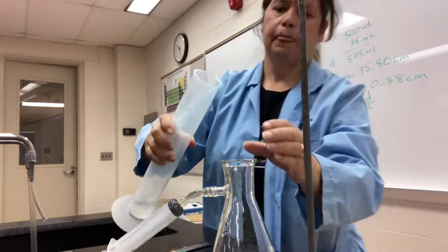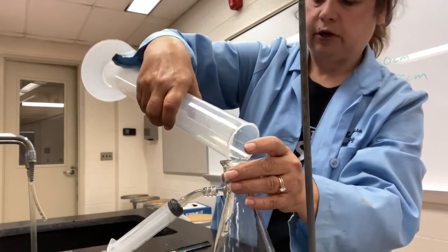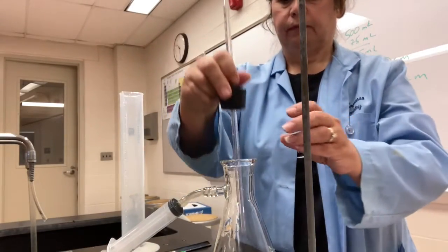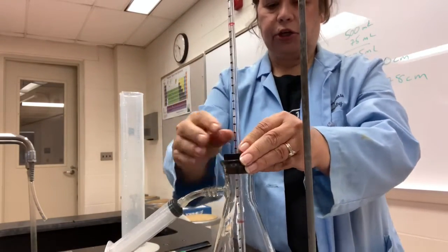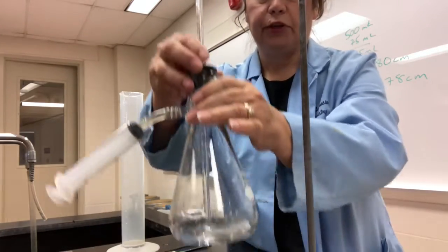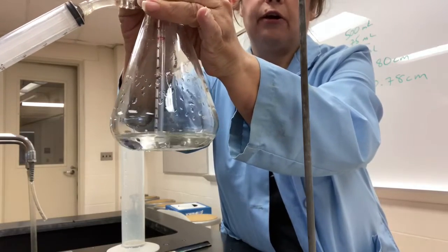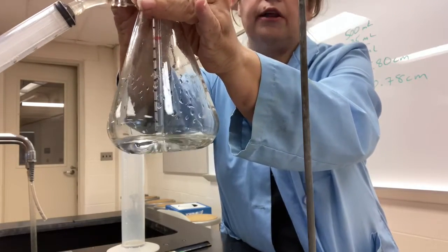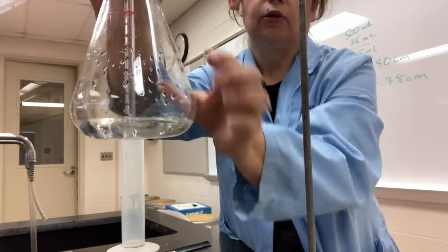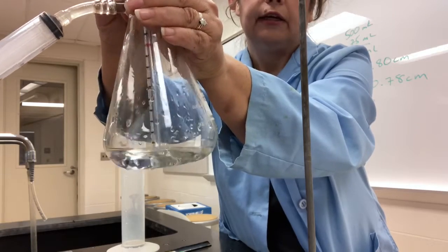There we go. So we add the 50 milliliters of water, and then we're going to go ahead and set the apparatus up. You have to make sure, here I want to show you something real quick. So when I put the tube in, I have a set volume. When I push down on the tube, on the cork, you can see a little of the water level come up. I don't know if you can see that or not. Let me try that again.